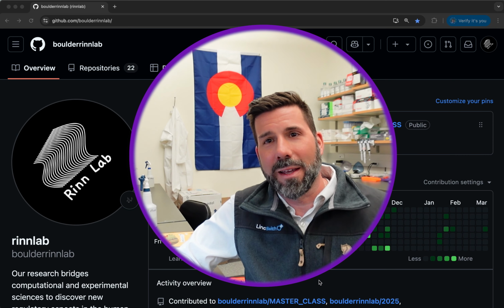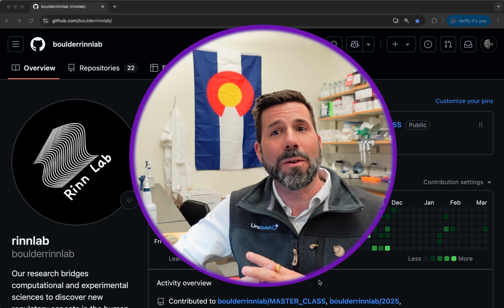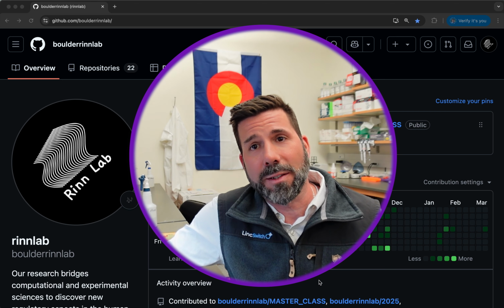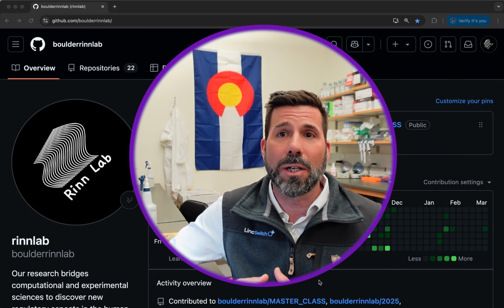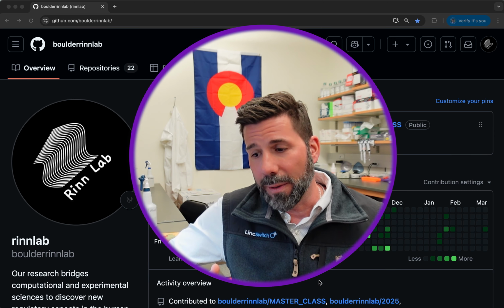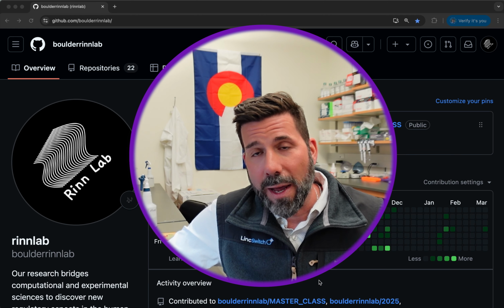Hello, welcome back to our last class in level 9, where we're going to bring all those lessons together and address the question: does doxycycline affect ATAC or epigenetic sites in the genome from going from open chromatin to closed, or closed chromatin to open? And through the last series of 5 classes, we've figured out that it doesn't.